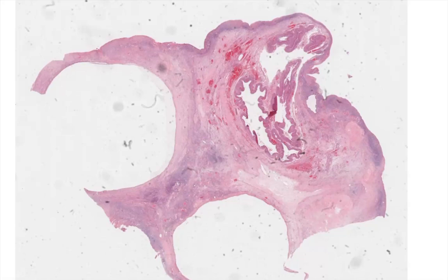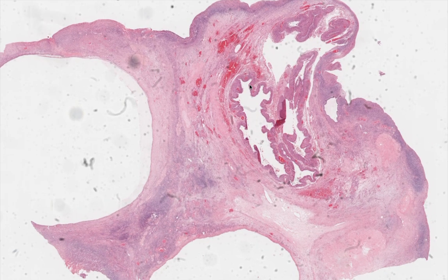This somewhat dusty slide of the ovary has three structures that will be interesting to examine. These two similar ones here, and this one here. Maybe the smaller structure here. Okay, so we've got this structure here.